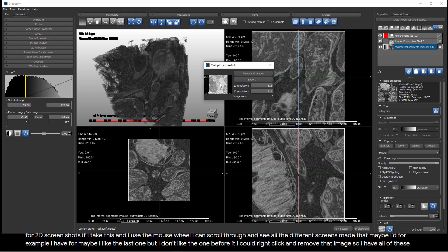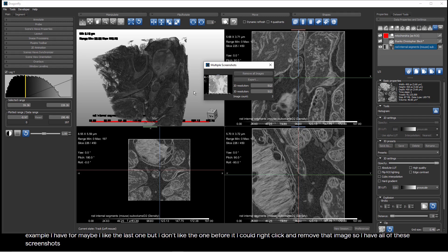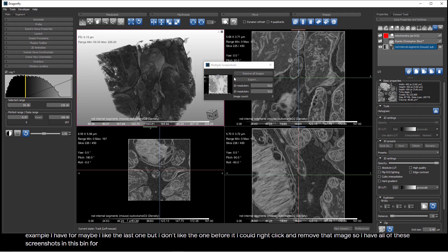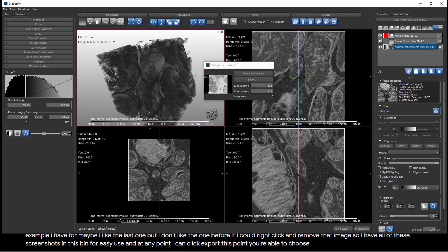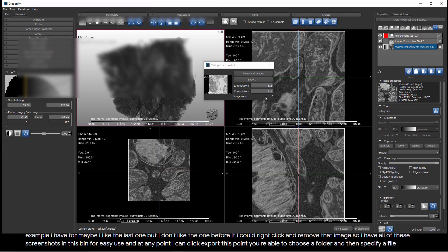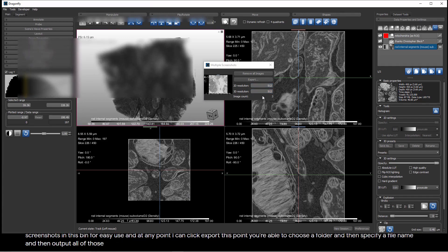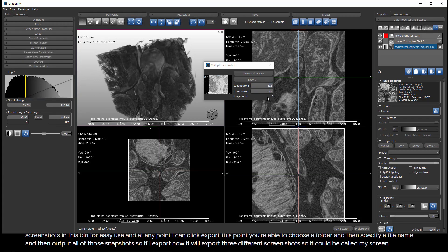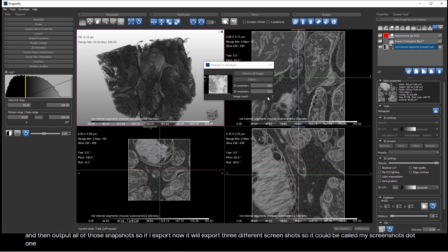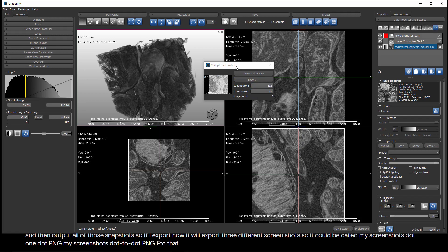So, I have all of these screenshots in this bin for easy use, and at any point, I can click export. But at this point, you're able to choose a folder, and then specify a file name, and then output all of those snapshots. If I export now, it will export three different screenshots. So, it could be called myscreenshots.1.png, myscreenshots.2.png, et cetera. That enables you to capture all of your screenshots in one bin and then export them quite easily.